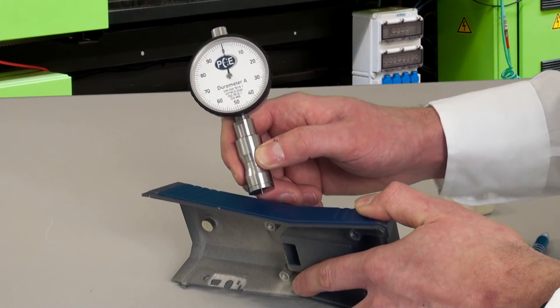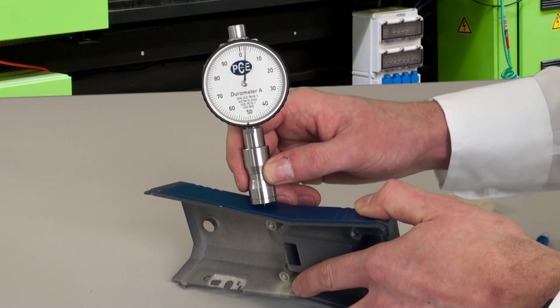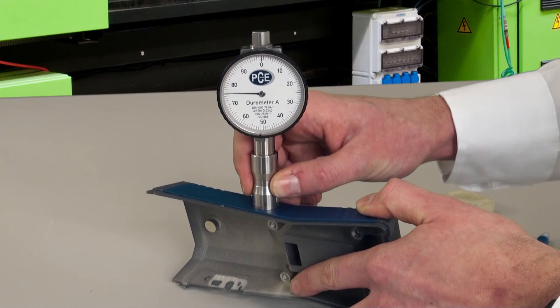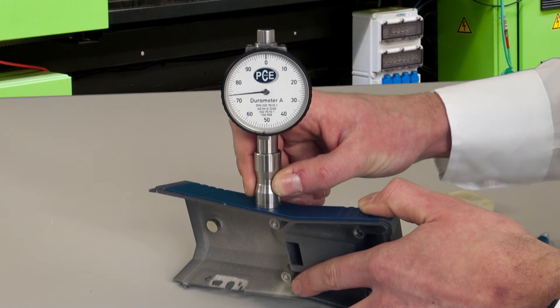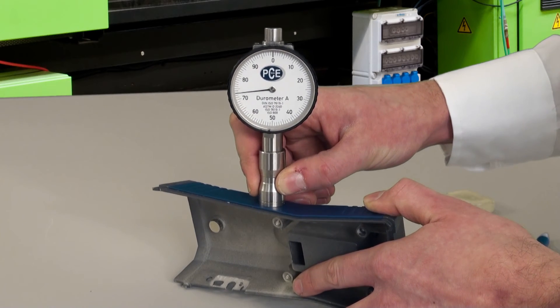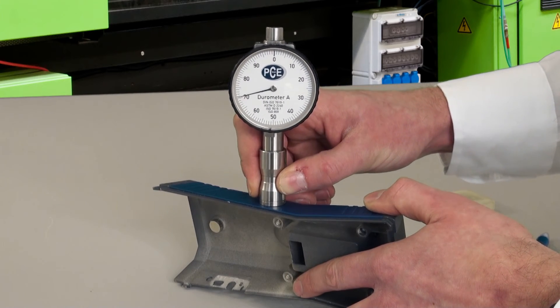We can now put the durometer onto this injection molding and onto the rubber coating. Here it behaves exactly the same — put it flat onto the surface, wait until the pointer is stabilized, and read the value. Here we are around 72 Shore A, and then the measurement is finished.